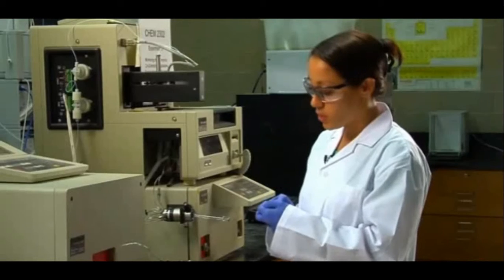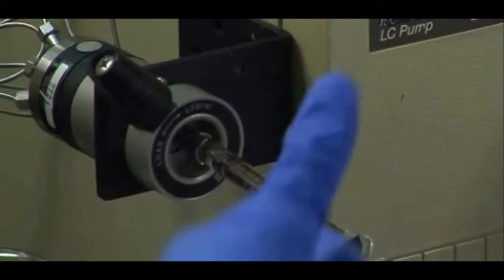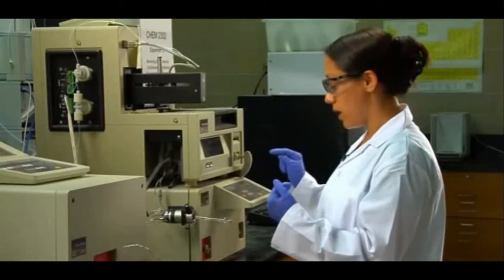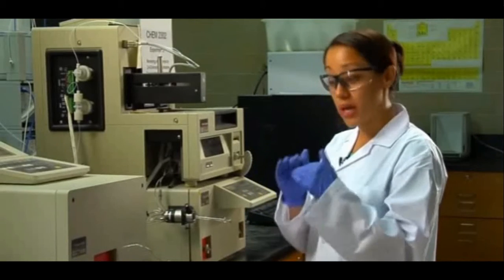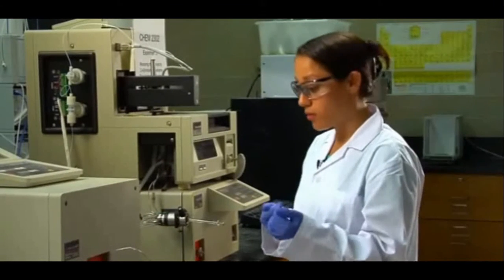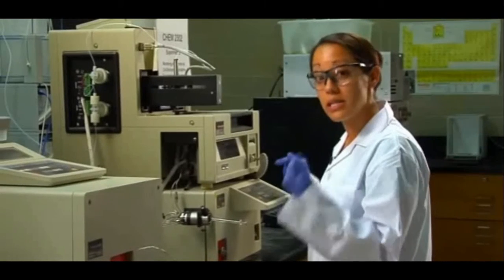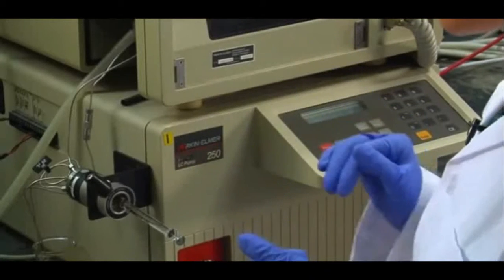With everything up and running, the next thing you want to do is turn the knob into the inject position while pressing run method. This syncs your sample loading into the HPLC system with the detector running at the same time. Your chromatographs — which are important when talking about retention times, helpful in indicating what your compounds are — you want to make sure you're consistent every time. If you do it the same way every time, it should remove that form of error.